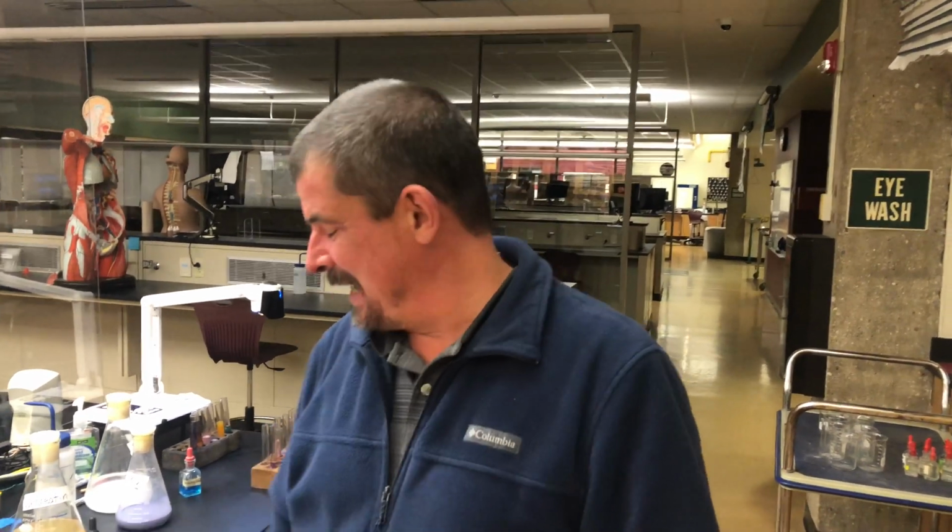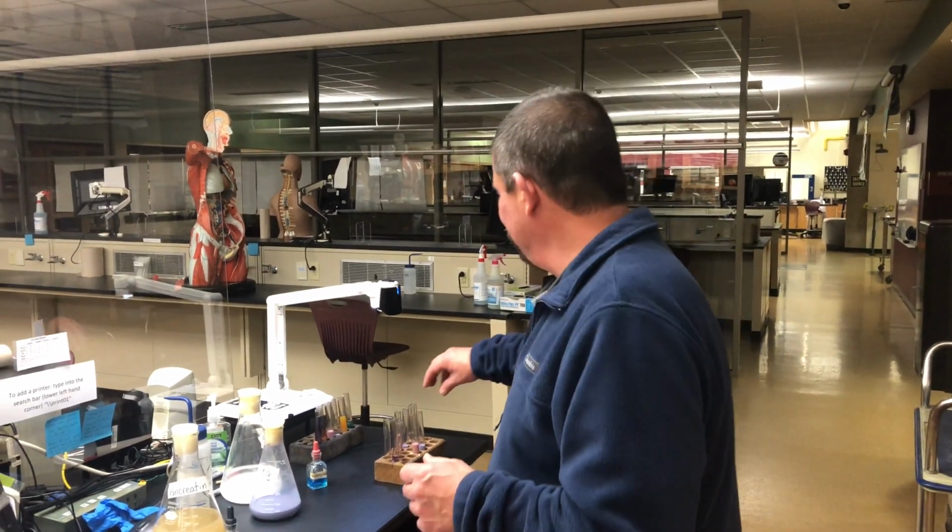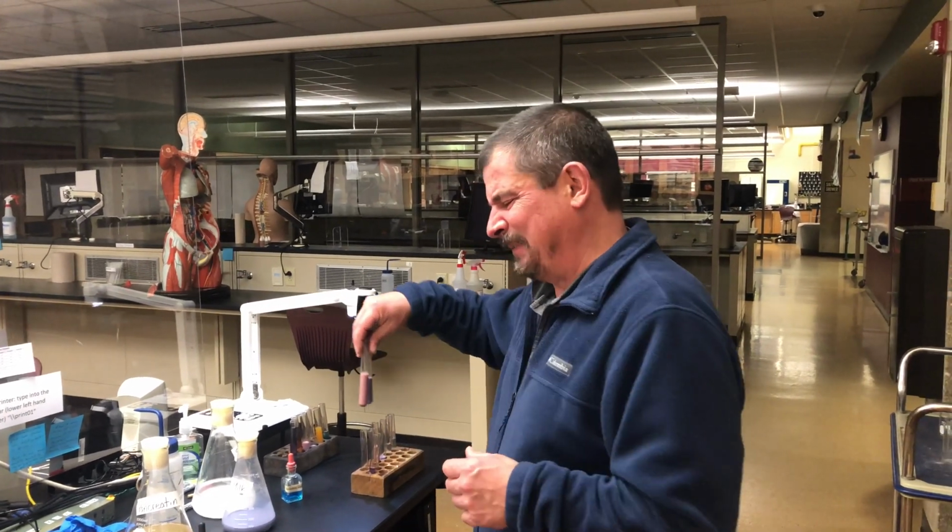And again, why do we add the pancreatin? The pancreatin is what contains the enzymes that are needed to speed up digestion. So we put those tubes again in an incubator for about an hour and a half at 37 degrees Celsius. And then the end result is, this is what we end up producing right here.